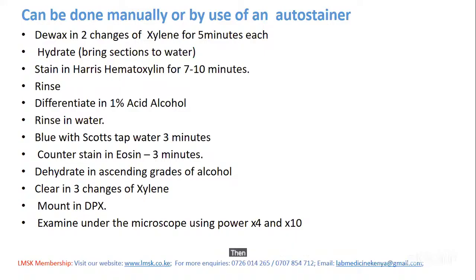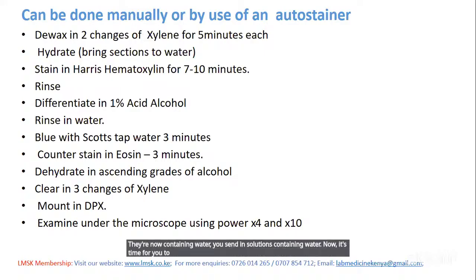Then you now dehydrate. You've brought these sections to water, so they now contain water, and you've stained in solutions containing water. Now it's time to remove that water again, because you're going to clear in xylene, and xylene and water are not miscible.